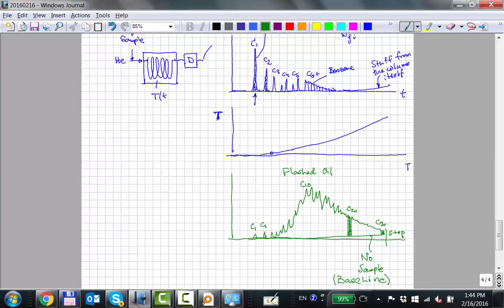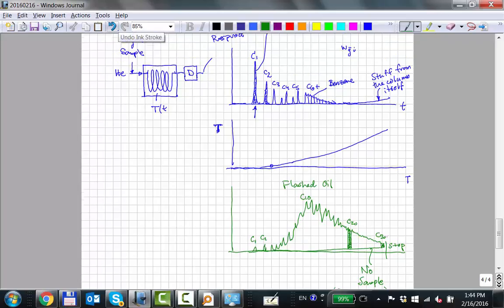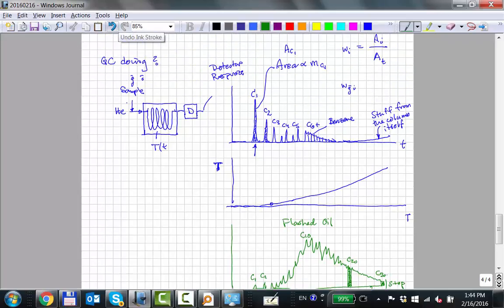So what they do before they put the oil sample into the container, it's actually a syringe, like a needle. This sample is actually our surface oil plus maybe 5% by weight, I'm not sure how much it is, of some strange hydrocarbon.